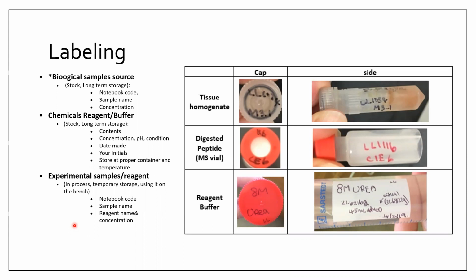So here's another story. I was supposed to put ABC, ammonium bicarbonate, into my protein digestion, but instead I put something else. The next day after incubation, I saw, oh gosh, why is it all crystal? Apparently I did not put ammonium bicarbonate.